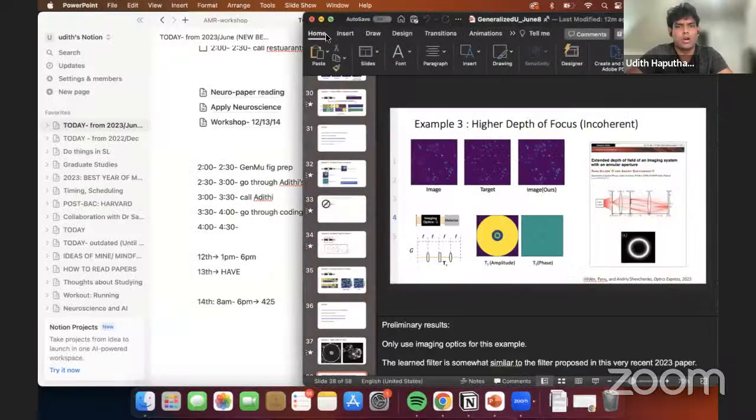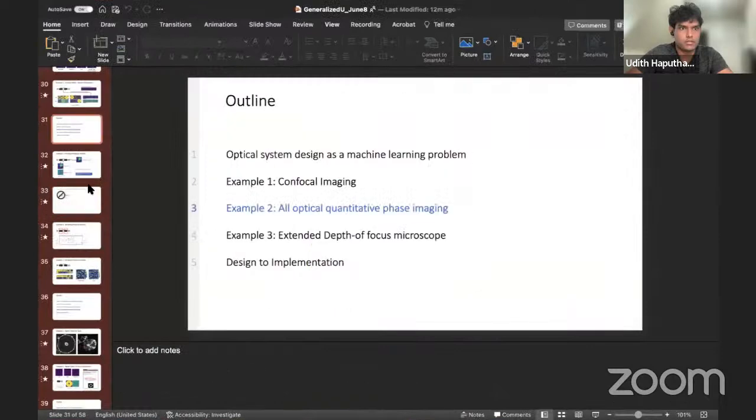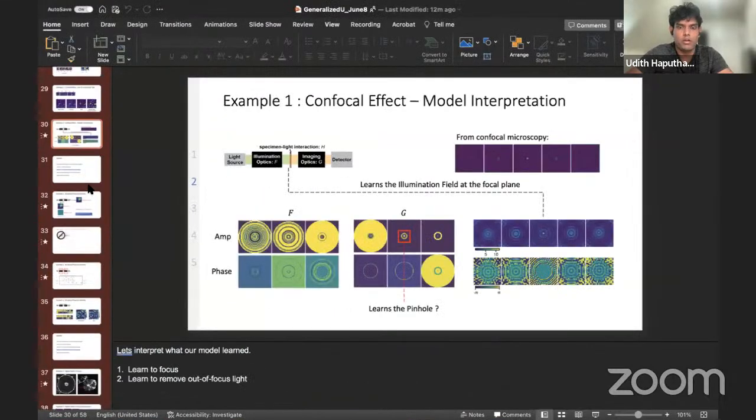Okay, so mostly the objective is qualitative performance. It is not a quantitative measurement. I just visualize all things in a grid and eyeball it, mainly because when the pinhole size changes, it sometimes gets really bad.